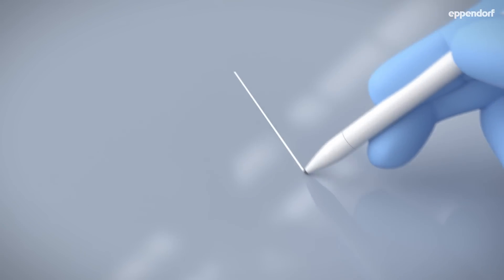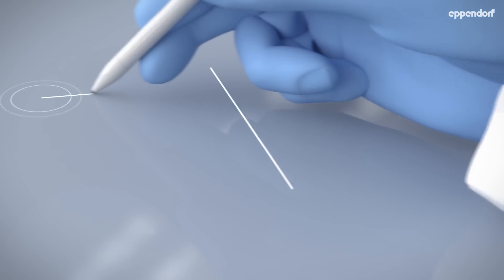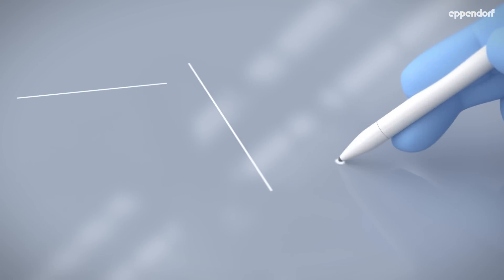Okay, now let's move on to the two most common manual pipetting techniques: forward pipetting and reverse pipetting.